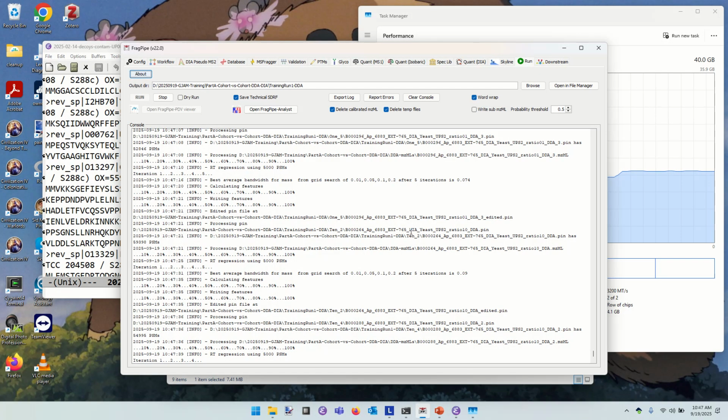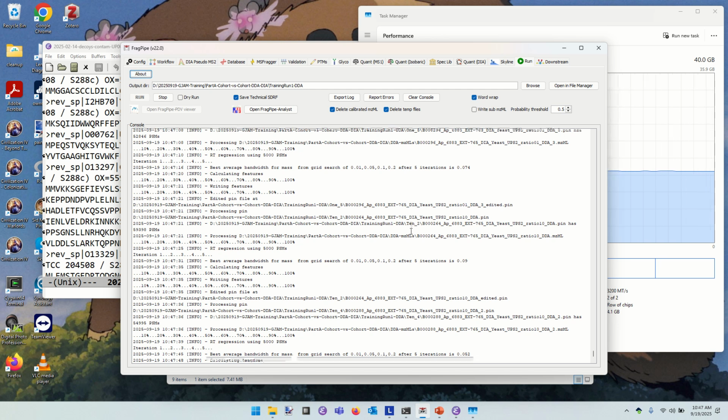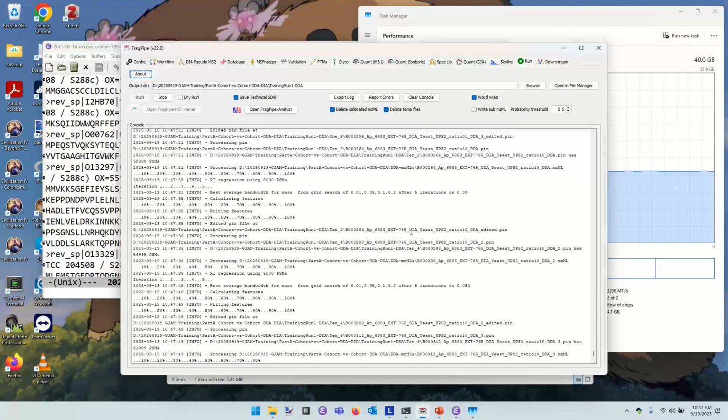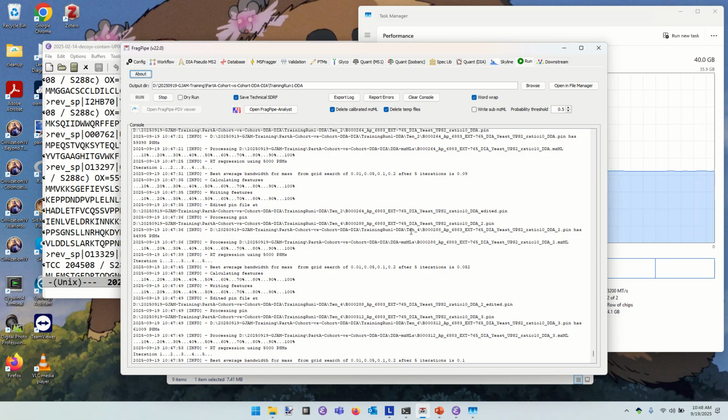They're almost always using Spectronaut, which is very much designed around DIA data analysis. Spectronaut has roughly the same kinds of questions you would ask in order to launch the software. You still provide a FASTA sequence database to say these are the protein sequences that are possible.